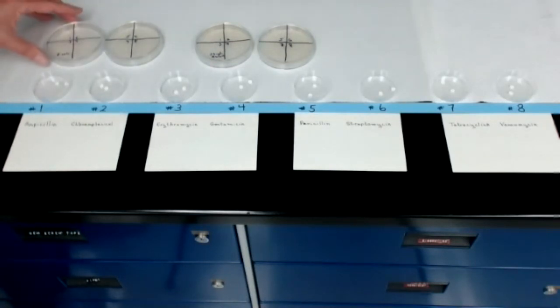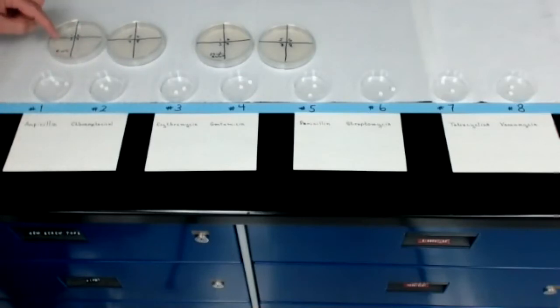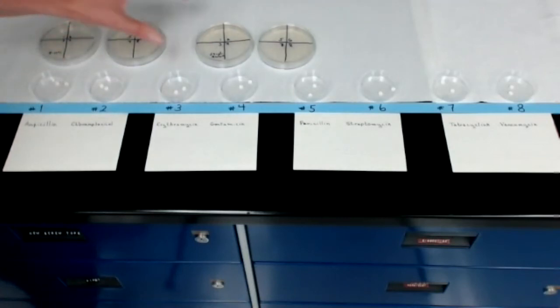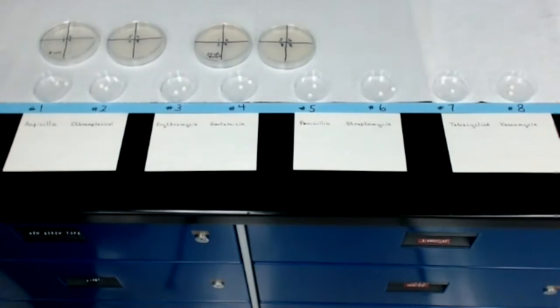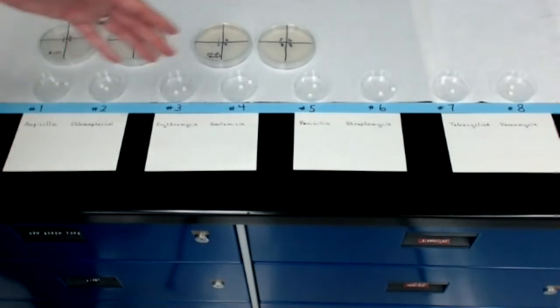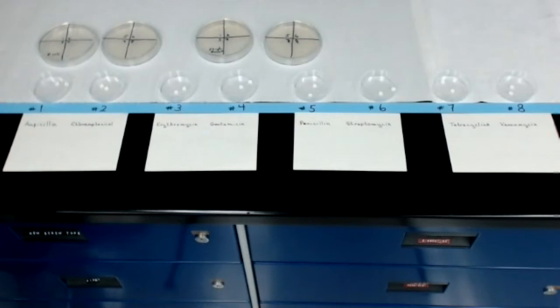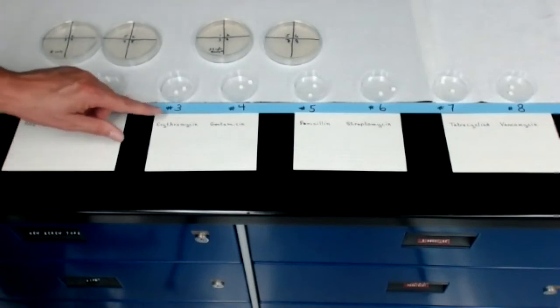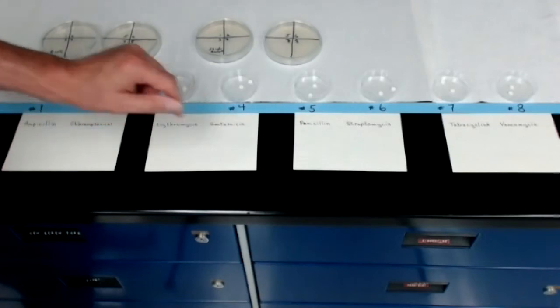So in other words, the ampicillin discs will be put in the number 1 quadrants on E. coli and Staph aureus. The number 2 discs, chloramphenicol, will be put on the number 2 quadrants of E. coli and Staph aureus, etc. When I am all done, I will have used up all the discs. So what I'm going to do here is I'm just going to go ahead and transfer several paper discs to the first E. coli plate. I'm going to be transferring discs 1, ampicillin, 2, chloramphenicol, 3, erythromycin, and 4, gentamicin.